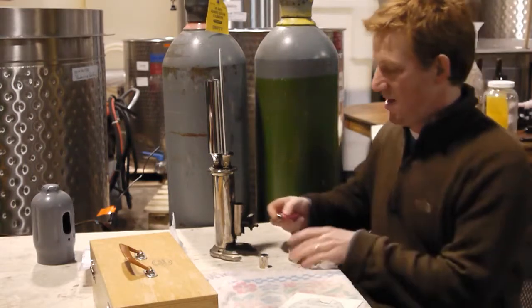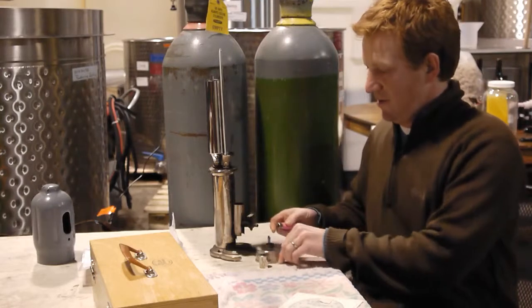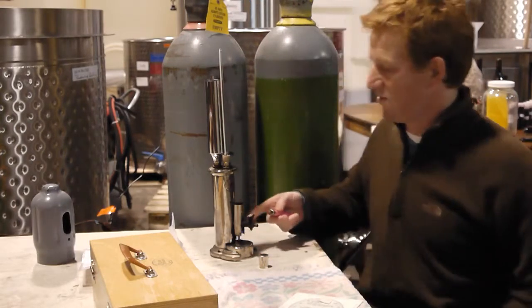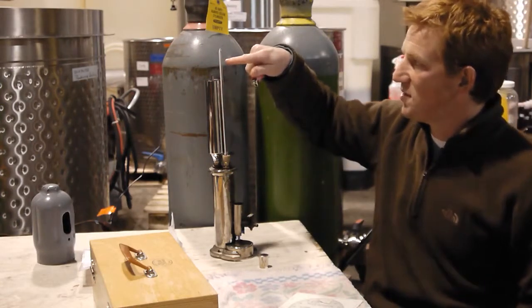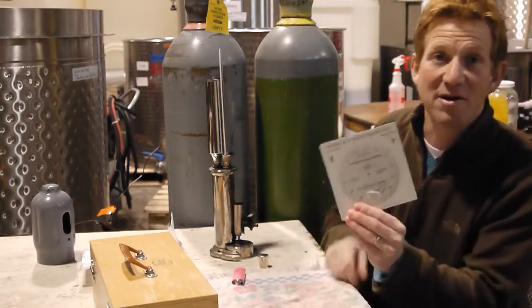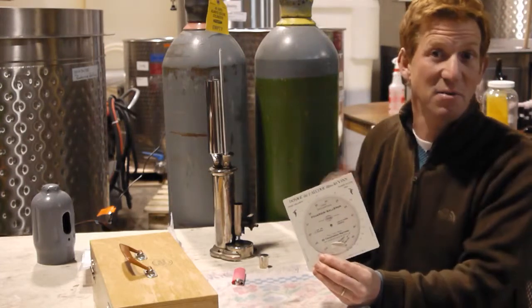We're going to light it up and first we're going to calibrate it with water. It's going to go in here — there's a chamber in here that bubbles off water. When it gets to 100 degrees, right up here where the mercury rises and stabilizes, then we set our chart and we can begin with the wines after that.